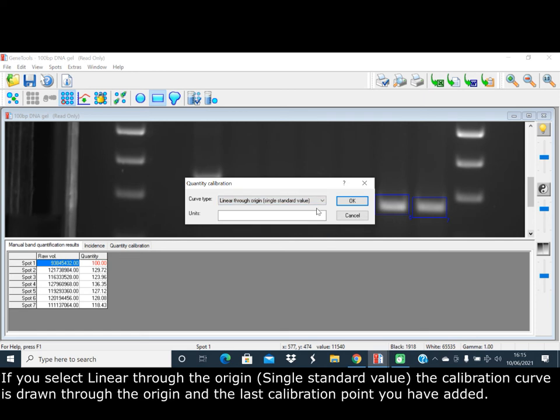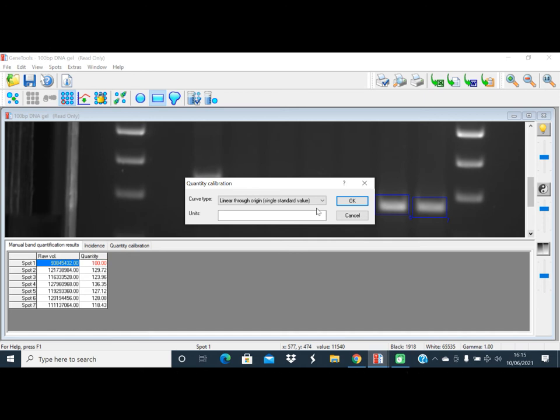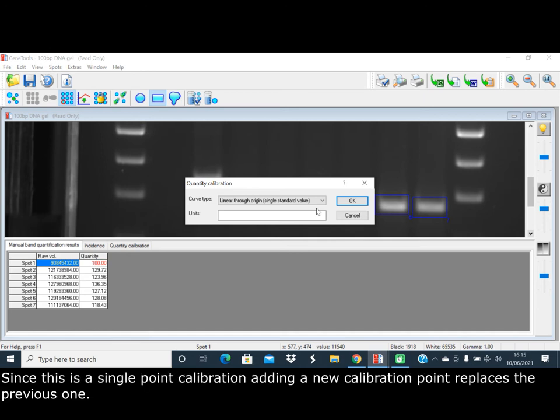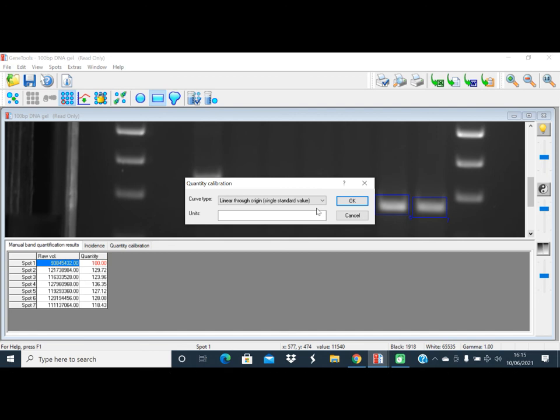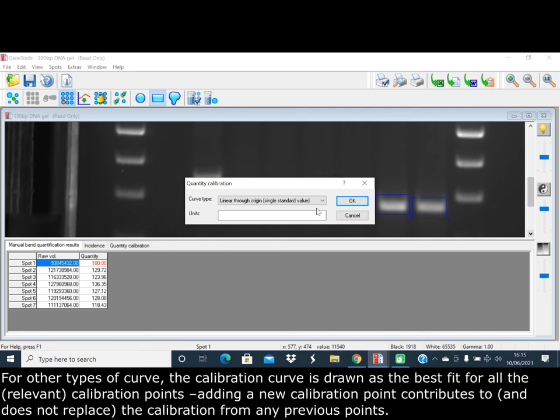If you select linear through the origin single standard value, the calibration curve is drawn through the origin and the last calibration point you have added. Since it's a single point calibration, adding a new calibration point replaces the previous one. For other types of curves, the calibration curve is drawn as the best fit for all the relevant calibration points. Adding a new calibration point contributes to, and does not replace, the calibration from any previous points.